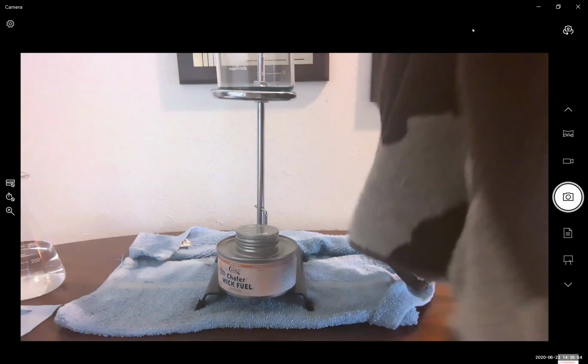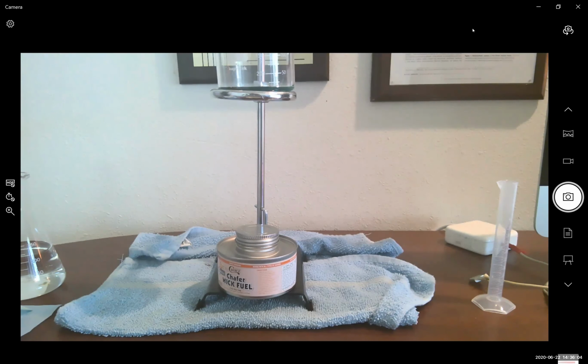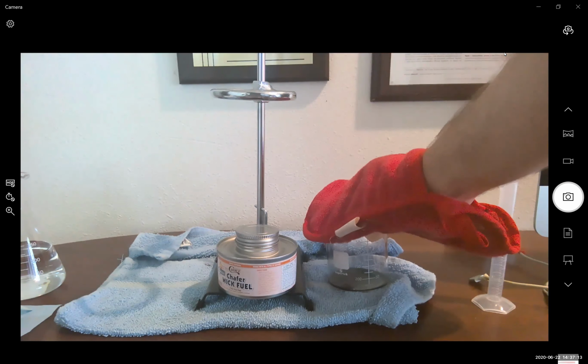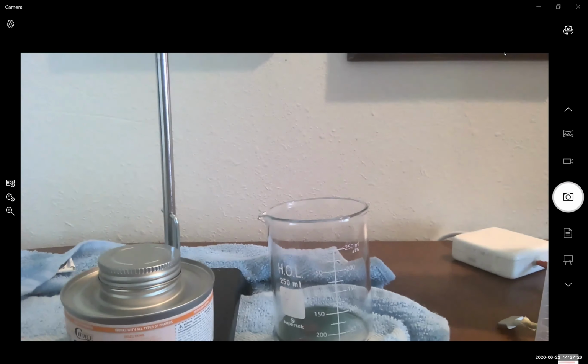So I'm grabbing, it's a little awkward with the home towel. Allow me one moment. I'm going to get out an oven mitt to make this a little easier. Okay, so let's continue. We're going to take our oven mitt and grab the top of our beaker, and place the beaker down on our insulated surface. We're going to allow our beaker to cool, and we're then going to discuss how to process our solution.